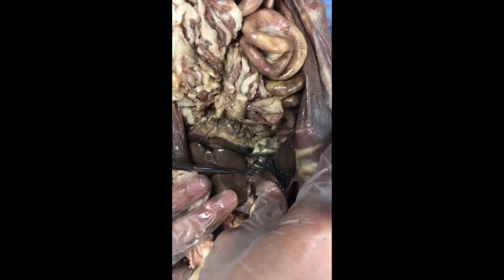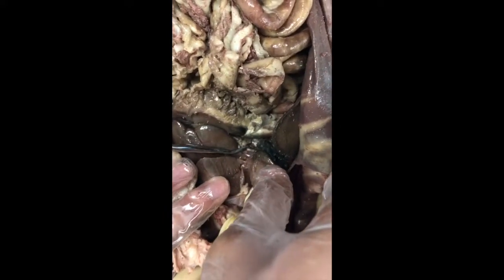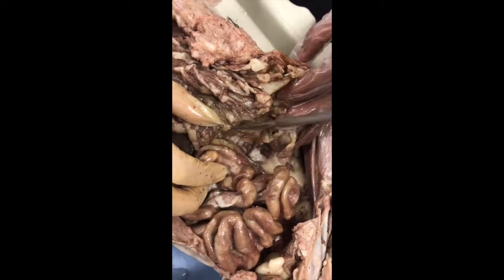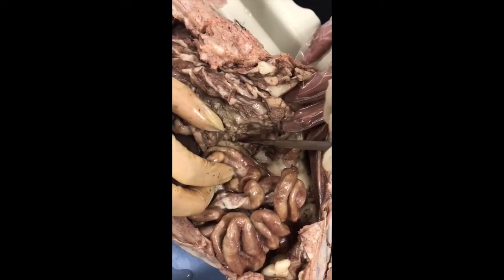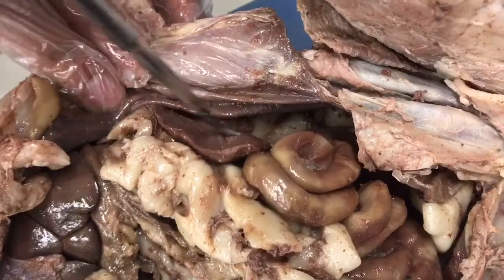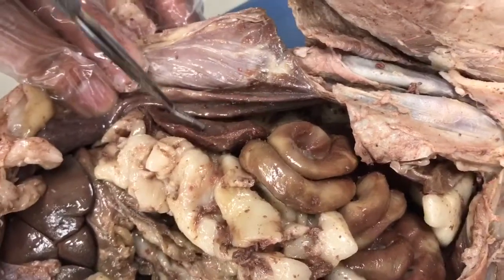This is the bile duct. It's deep to the liver, and its function is to transport bile from the gallbladder into the small intestines. This right here is the pancreas. It's deep to the omentum, and its function is to make digestive enzymes in order to break down food. This is the spleen. It's lateral to the omentum, and its function is to filter out red blood cells.